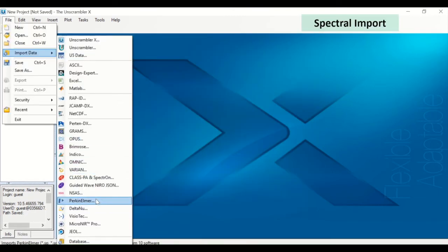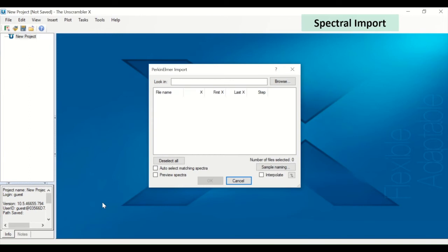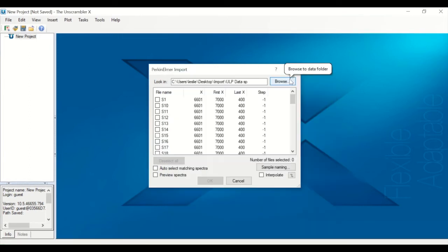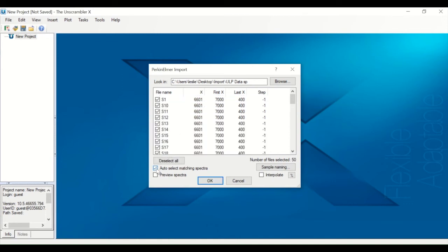When importing spectral formats, for example from a Perkin-Elmer spectrometer, browsing to the location of the files will populate the Import dialog box with all Perkin-Elmer files in that location. Selecting one of the files and ticking on Auto-Select Matching Spectra makes the selection of all files easier.